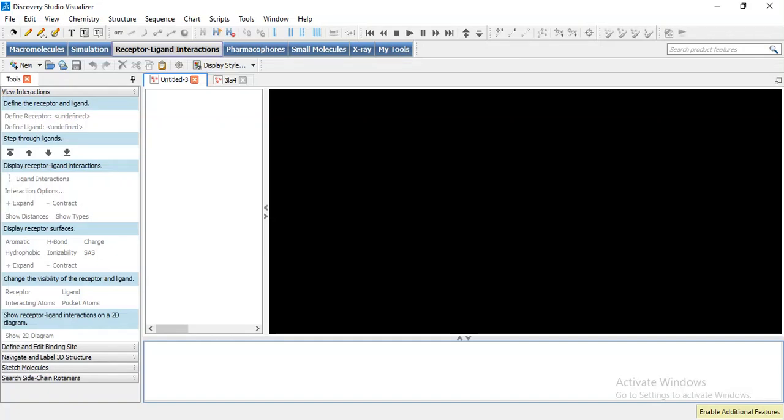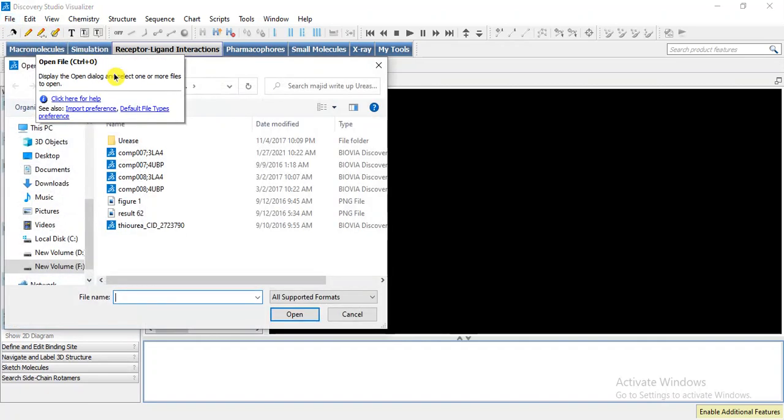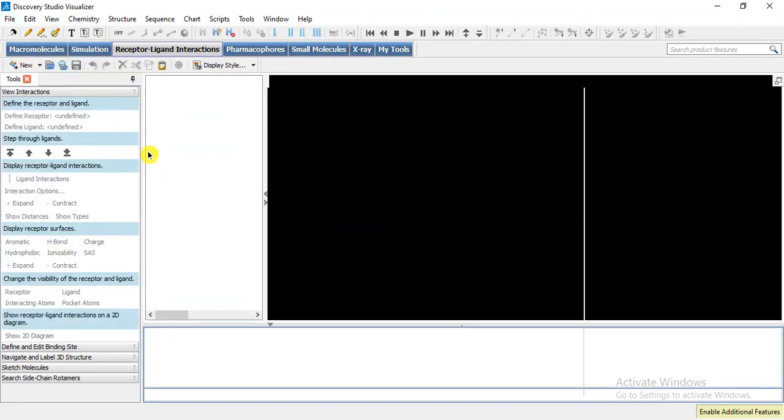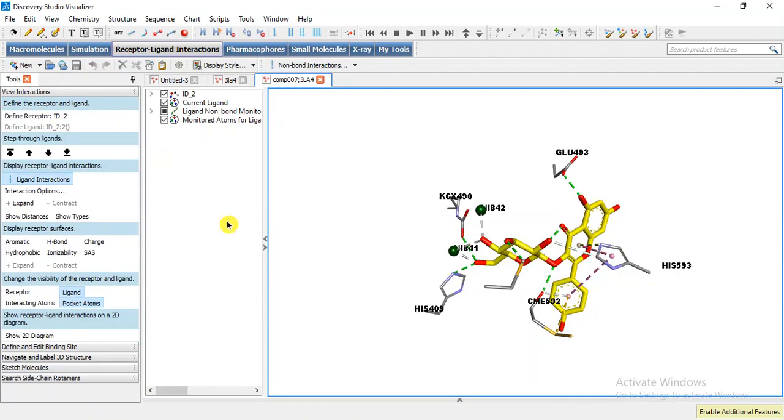In our previous video we studied how we can capture a 3D model of ligand target interaction. Today we are going to discuss how we can make a 2D two-dimensional model of the ligand target interaction. Suppose we have a saved file in Discovery Studio Visualizer, a DSV file, and I am going to open it. This is the previously saved file and I am going to make a 2D model of this 3D interaction.